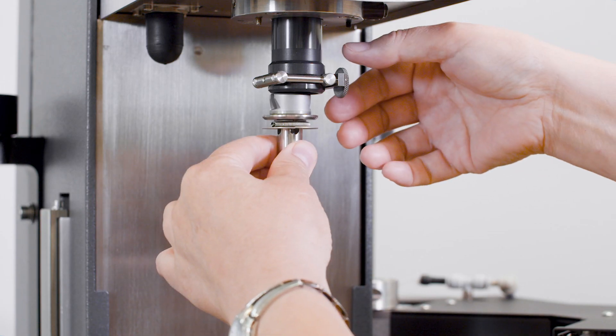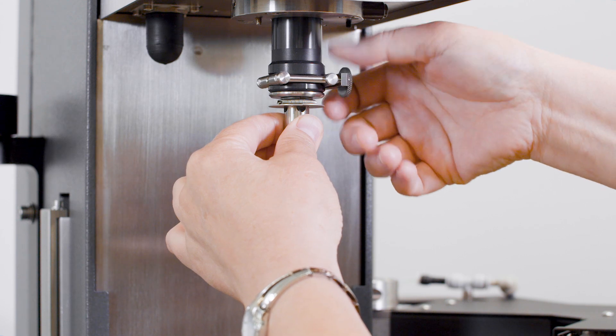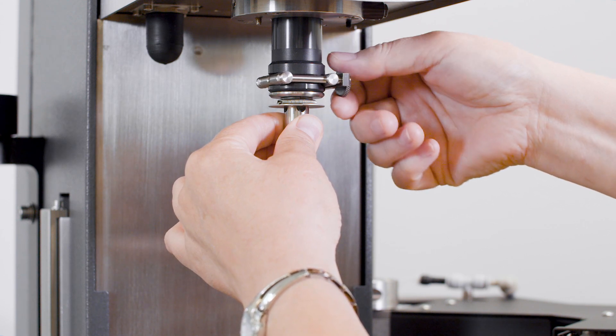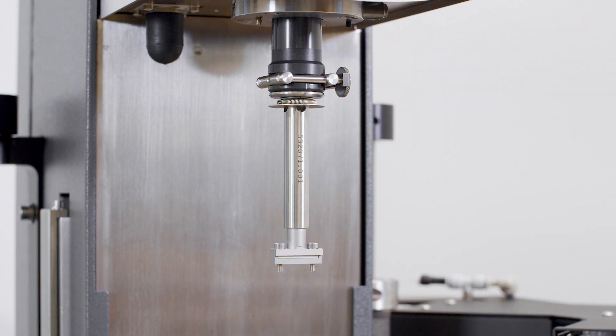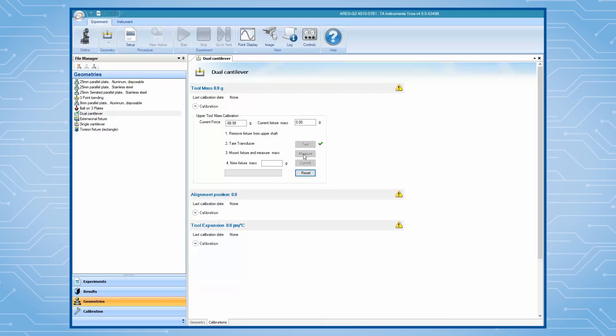mount the upper fixture to the shaft. Measure the mass of the upper tool. Click on Commit to complete the two-mass calibration.